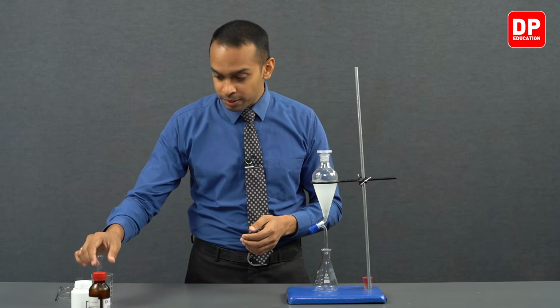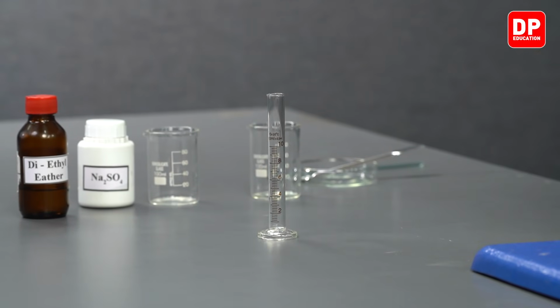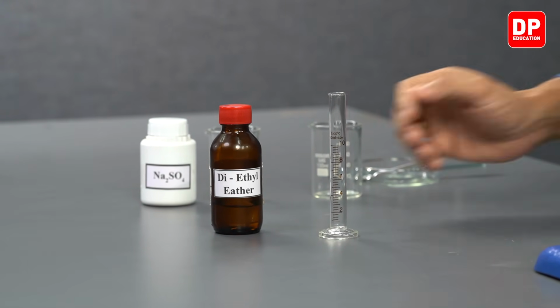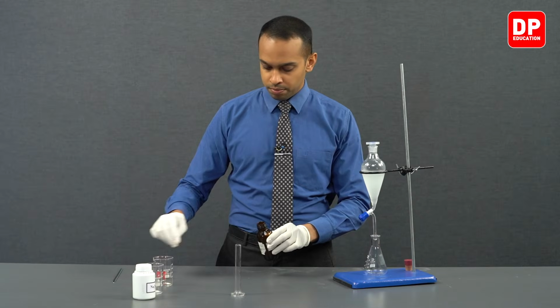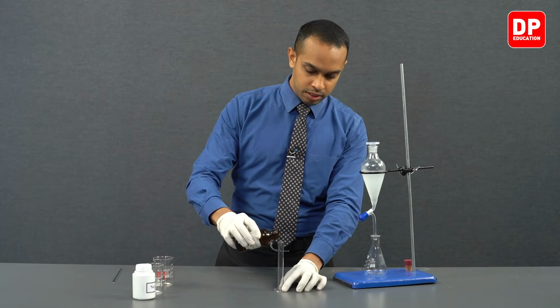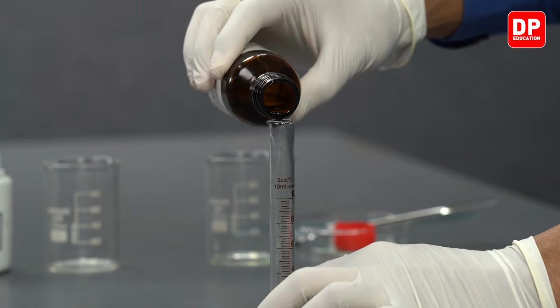So we have our measuring cylinder here. We are going to measure 10 milliliters of diethyl ether and transfer that into our separating funnel. We'll be measuring 10 cubic centimeters, or 10 milliliters, of diethyl ether.